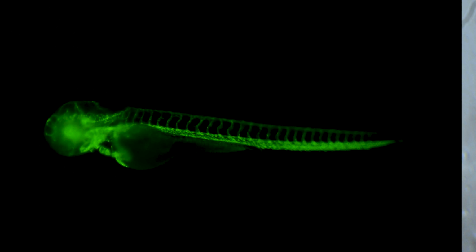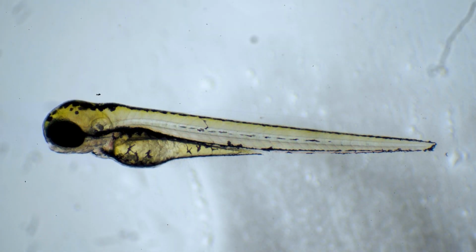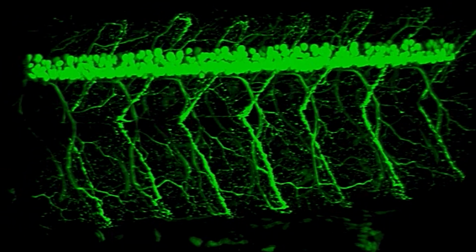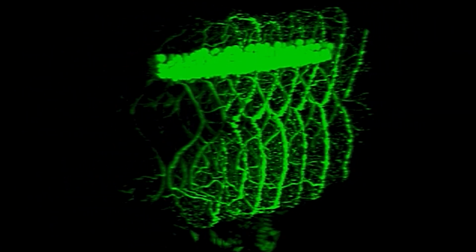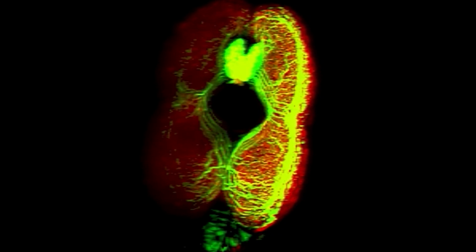and it is very important, it is transparent, so you can, for example, here see the blood going through this animal, you can see the heart beating, and with the use of specific fluorescent proteins, we can highlight and observe a specific tissue. For example, here the muscle fibers or the motor neurons, the neurons in general as well. And for example, when I reproduce motor neuron disease, we can observe the progress of neurodegeneration in MND.